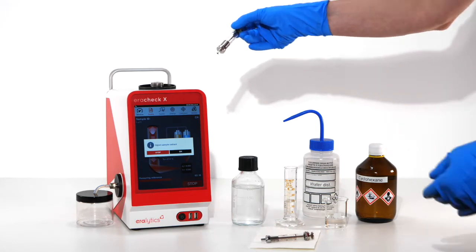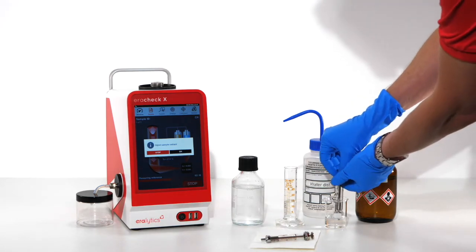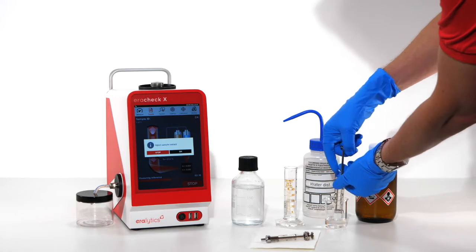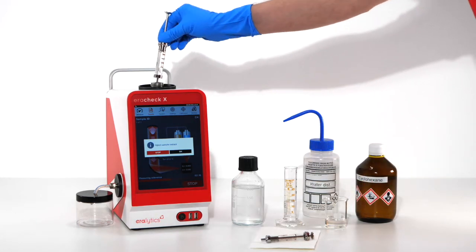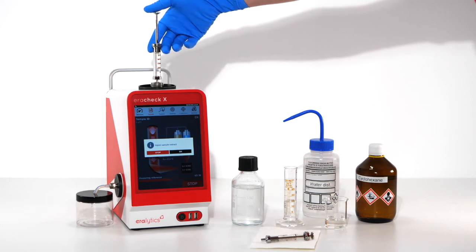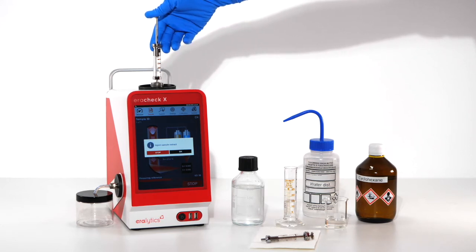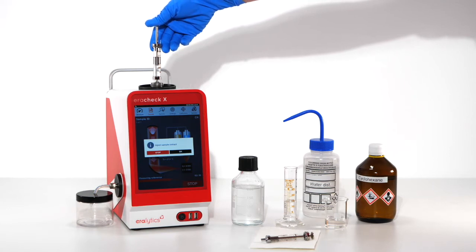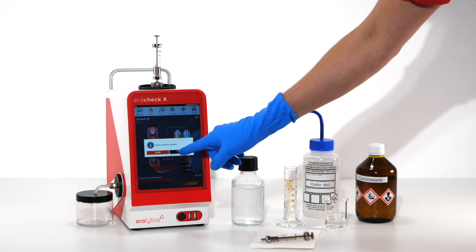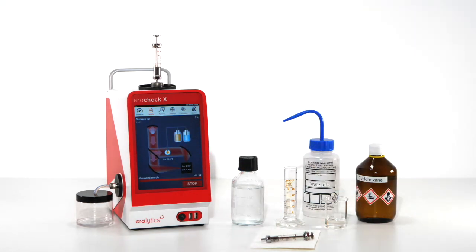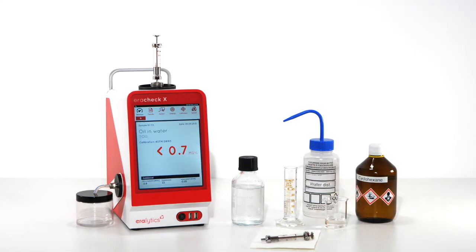Then refill the syringe, attach it to the inlet assembly. Inject another 5 ml of cyclohexane and click OK to proceed. The instrument has now been verified.